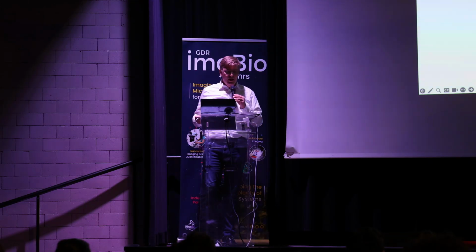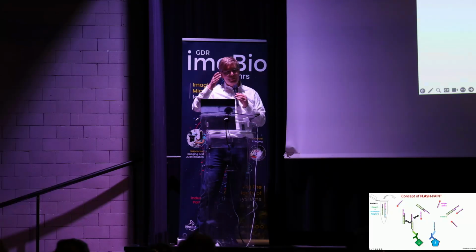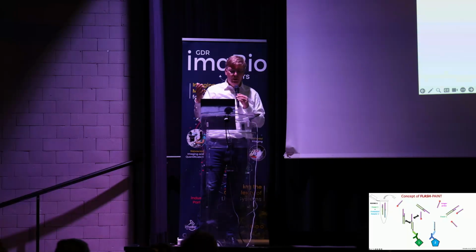that cocktail. You add what we call an eraser against the first transient adapter, and at the same time a new transient adapter. So the eraser will bind to the earlier transient adapter, and since the transient adapter is binding transiently to the target, you just need to wait for 100 seconds or so. It will have come off the target anyway.